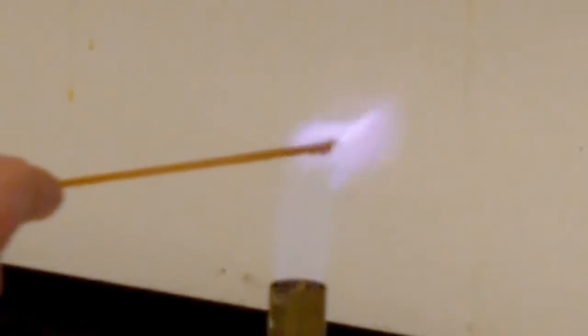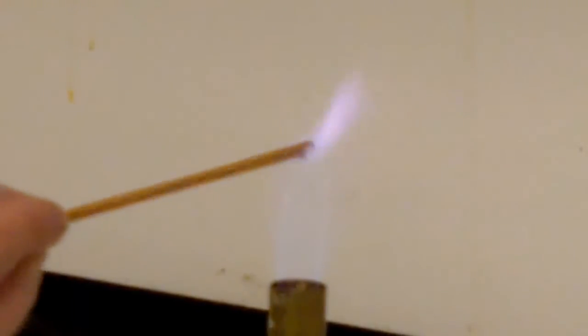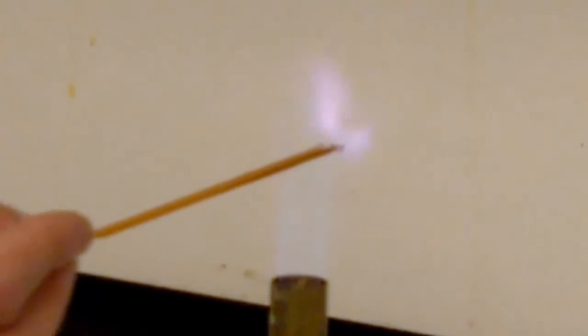Next is cesium chloride, which gives off a purplish color as it ionizes.